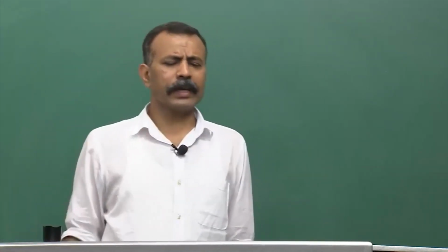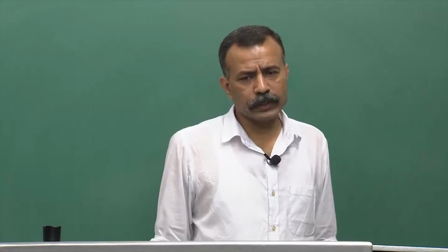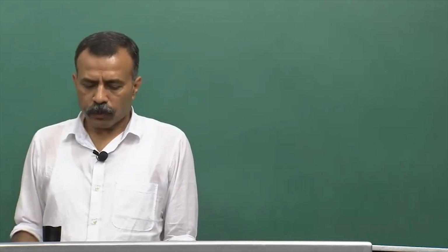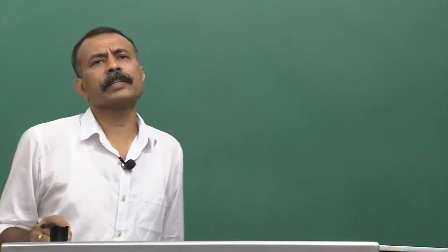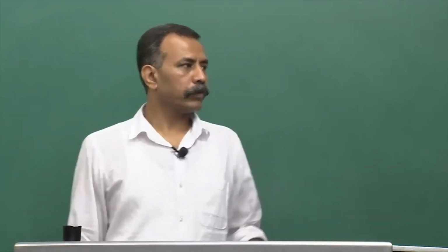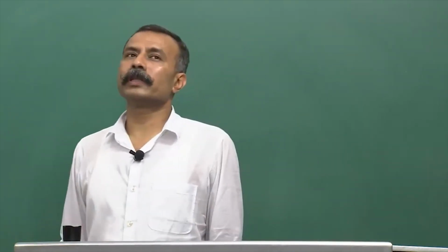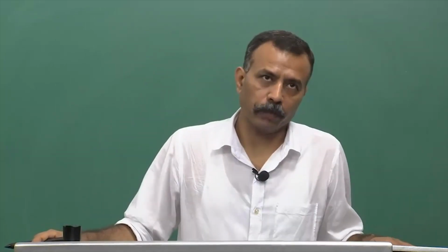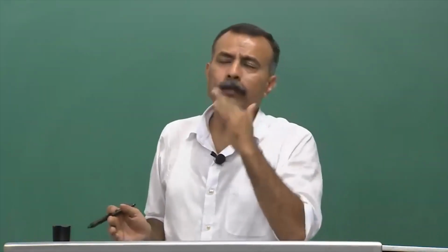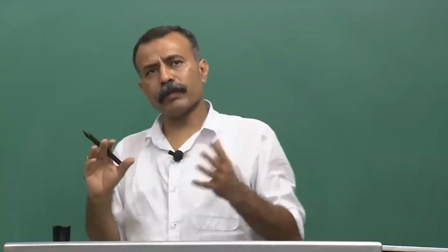While talking about designated people, this is something I have learned over almost 2 decades of experience. It is always a good idea for such specialized facilities to have designated people, who will be using it or ensuring it. Too many users in these kinds of facilities leads to a lot of contamination problems. It is not always a good idea that everybody gets in and gets out, unless this is your absolute private facility, your own facility and you are the boss. But when it comes to departmental and institute facilities, it is better to restrict.